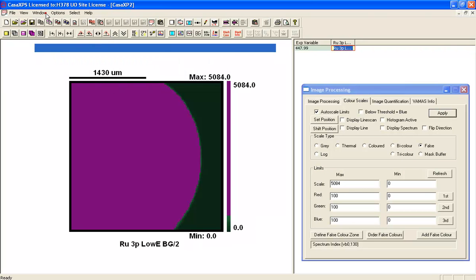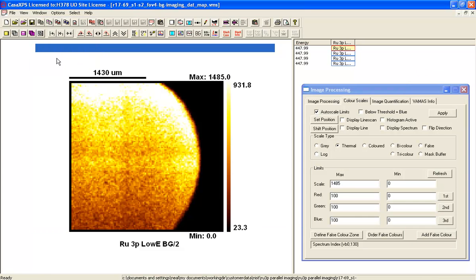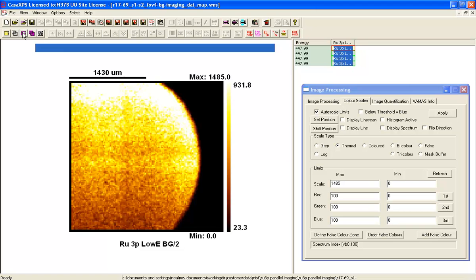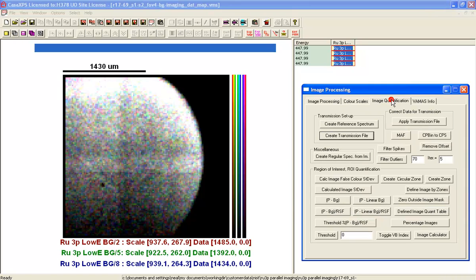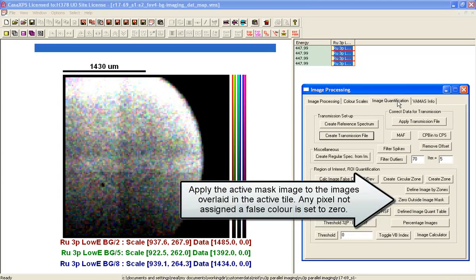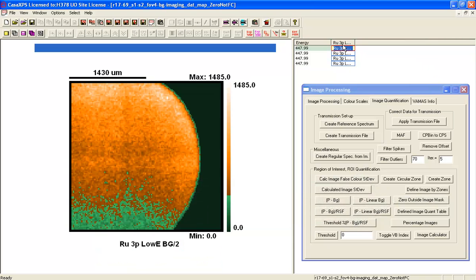And having done that, we can go to another set of images such as these original ones. If we overlay them, and then we can go to the image quantification dialog window and press the zero outside image mask, it creates a new VAMAS file.